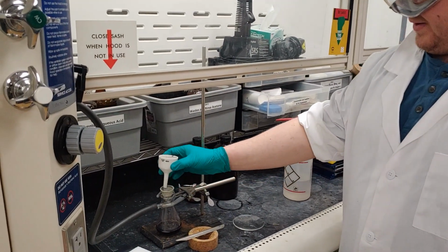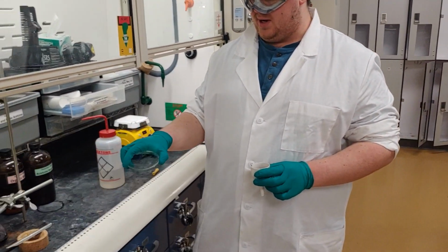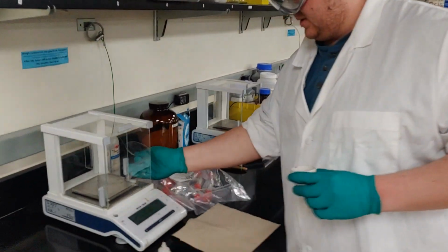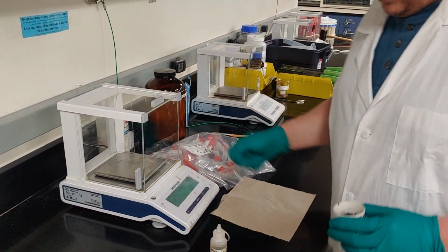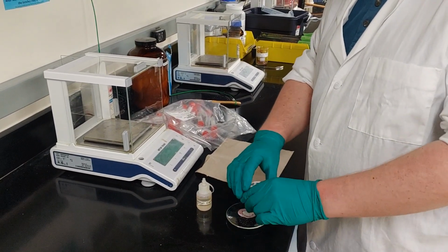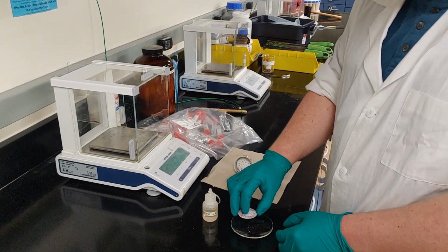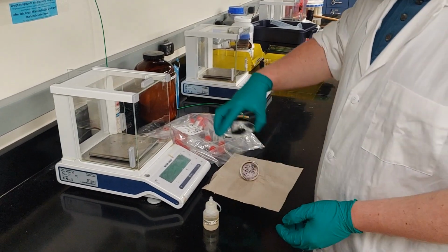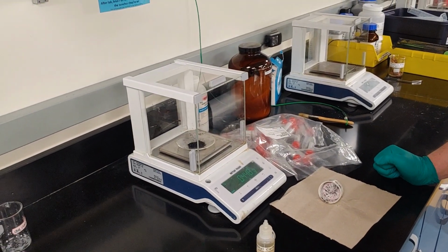So now, since I've left this on the vacuum for about 10 minutes, I can pour this onto a pre-weighed watch glass. So let's go over to the scales and tare the watch glass, and then transfer all of the product as possible onto the watch glass. I will then reweigh the watch glass to get my final product weight.